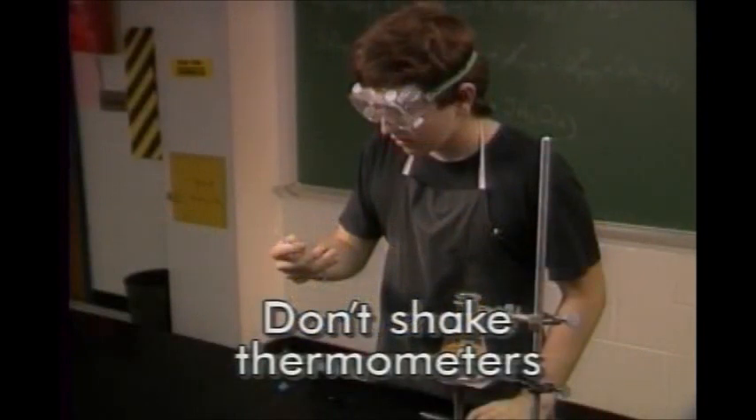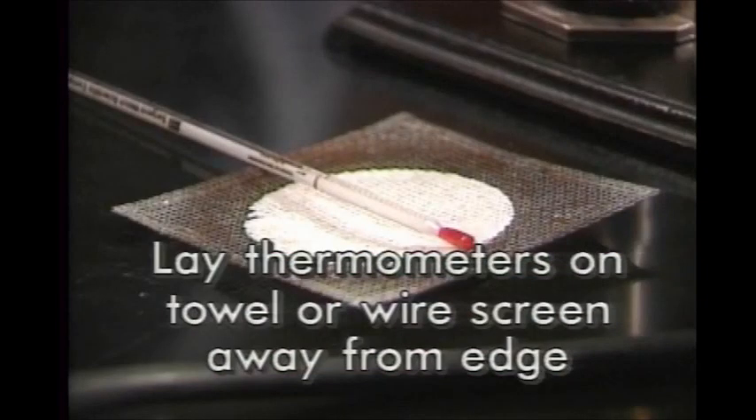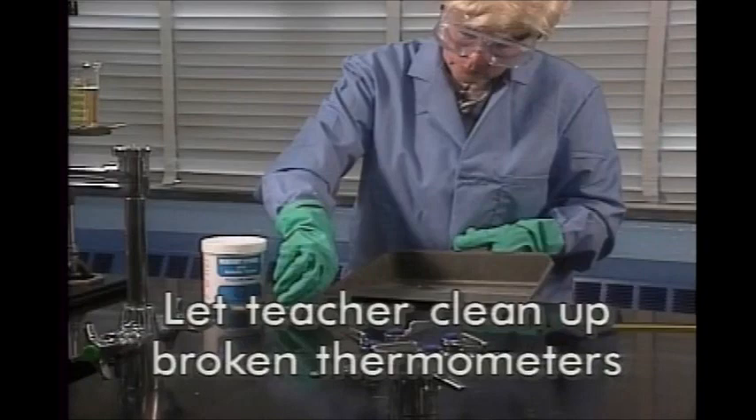Don't shake thermometers. Use thermometers only in the temperature range they're suited for. Lay thermometers down on a towel or a wire screen to cool, away from the edge of the bench. Let your teacher clean up broken thermometers.